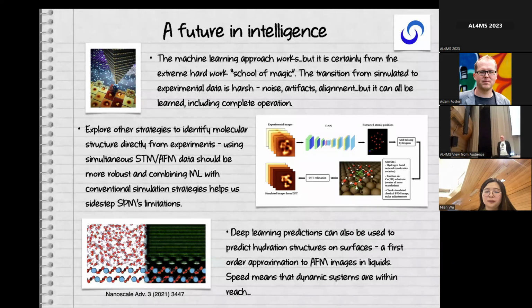We're trying this because there are so many artifacts in imaging in liquids. It's insane. They have made a huge effort to give us a ton of experimental data. So instead of taking the simulated data and making all this artificial noise, we might try and learn from the experimental data what is real and what is not, and try to denoise. But that's all I'll say. It's just starting, and you need so much data and it's not easy for them. You know very well in this high resolution, it's not easy. The other thing is we try and persuade them to let us have autonomous control. Can't we run all weekend while you're resting? But the Japanese, of course, are not resting at the weekend.